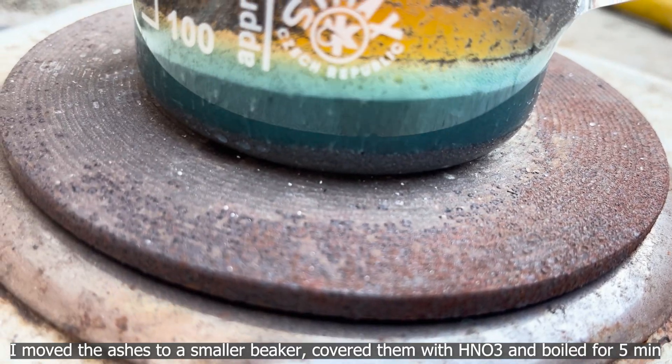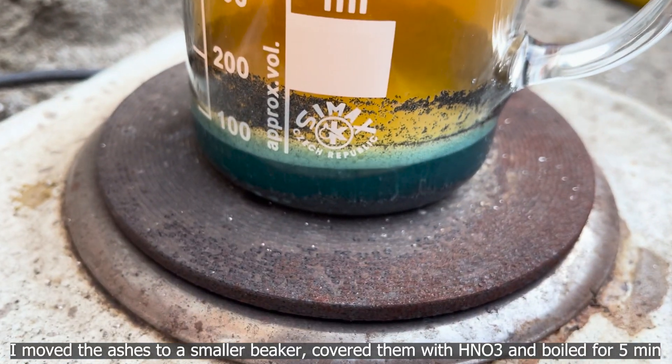I moved the ashes to a smaller beaker, covered them with nitric acid, and boiled for five minutes.